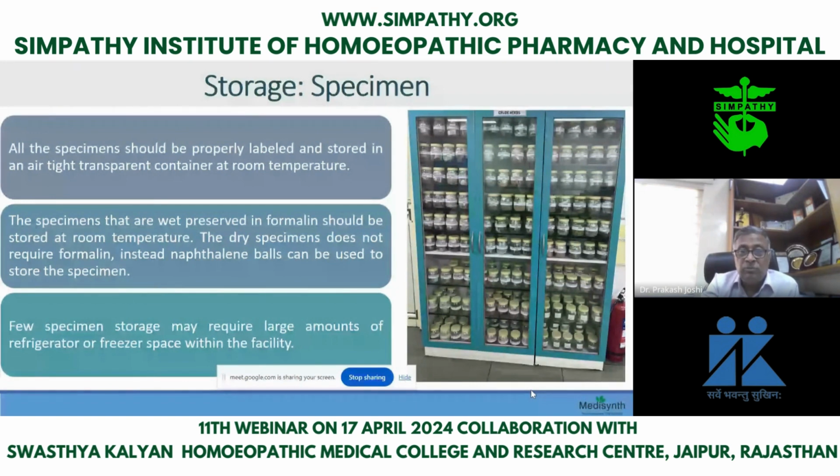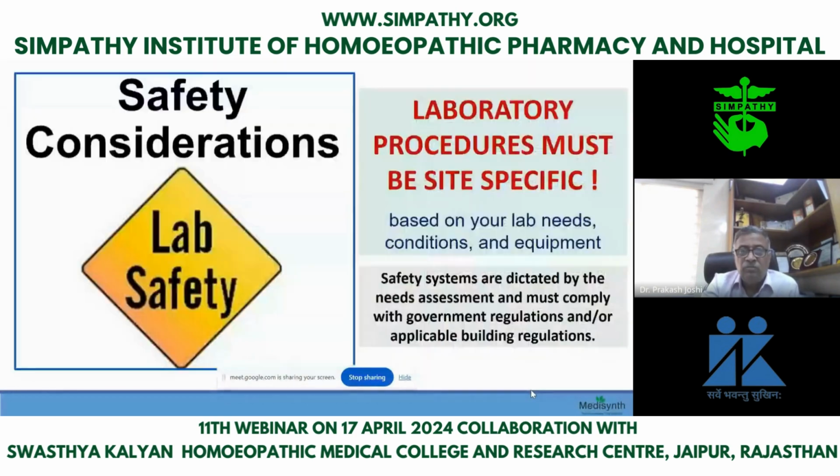So you can put some sellotape, something like that. And if they are wet preserved, FAA, formalin acetic alcohol, is used, and when it is dry, you put naphthalene balls. So these are the ways to store specimens of raw material, and you can store animals also. It is not a big thing.